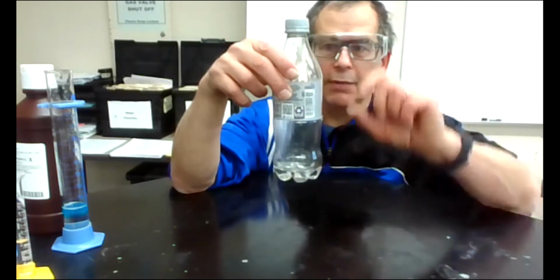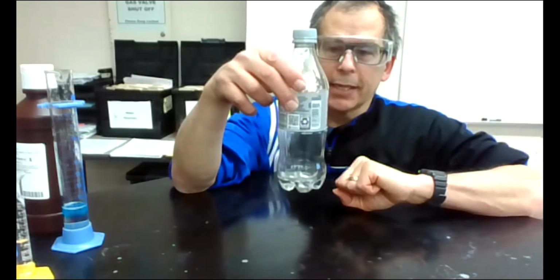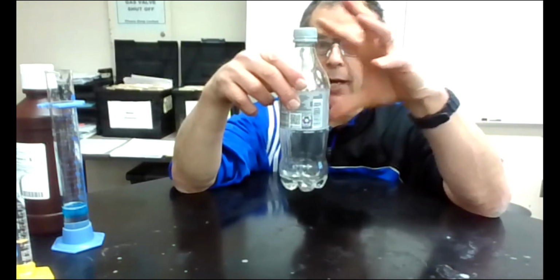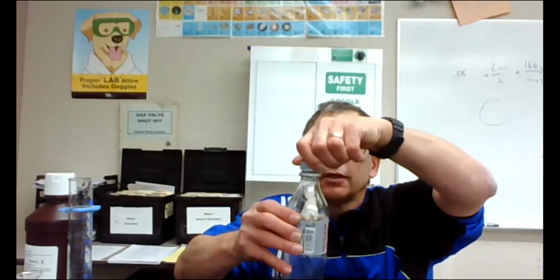And you can see I have something dangling here, and it is potassium iodide solid wrapped up. Now, ideally, if I were doing this, I wouldn't let you see that. I'd put it in an invisible string or a piece of thread. I might paint this gold so that you can see. When I take the lid off of this genie, so I call out the genie, I unscrew it, I take the lid off. Now what that causes is the catalyst to meet the hydrogen peroxide, and then out comes the genie.